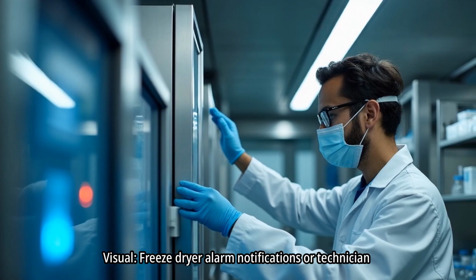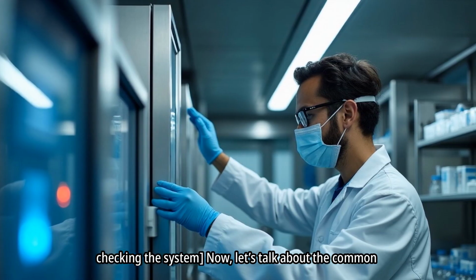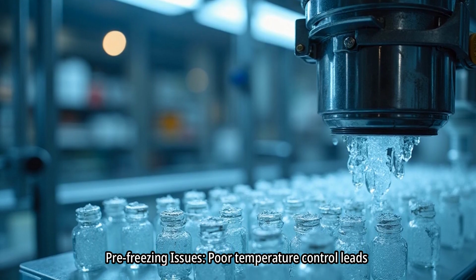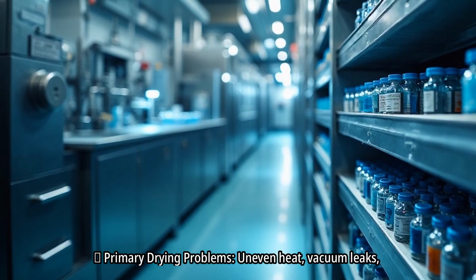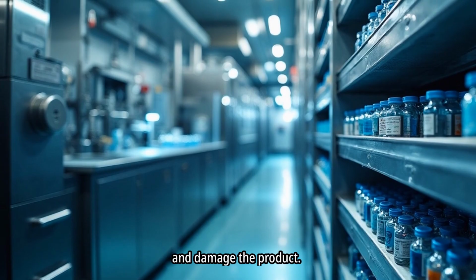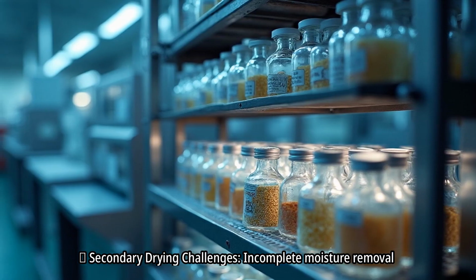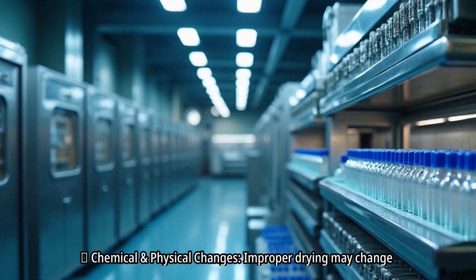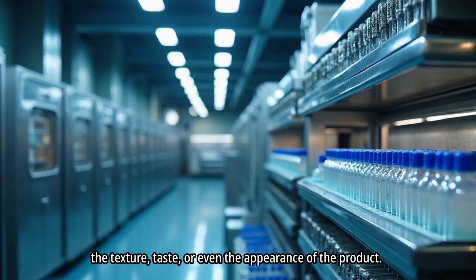Now, let's talk about the common problems during freeze drying. Pre-freezing issues. Poor temperature control leads to uneven ice crystals, which causes bad drying. Primary drying problems. Uneven heat, vacuum leaks, or unstable shelf temperatures can stretch drying time and damage the product. Secondary drying challenges. Incomplete moisture removal can lead to product instability and shorter shelf life. Chemical and physical changes. Improper drying may change the texture, taste, or even the appearance of the product.